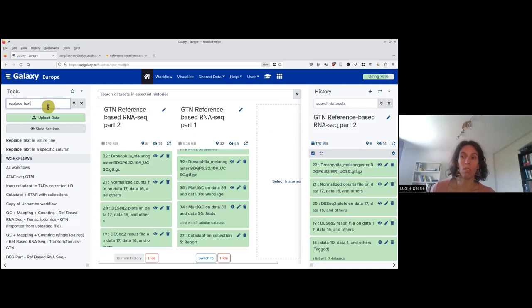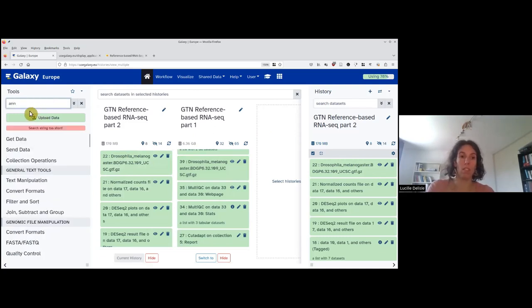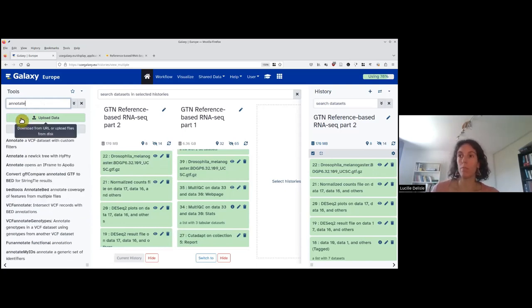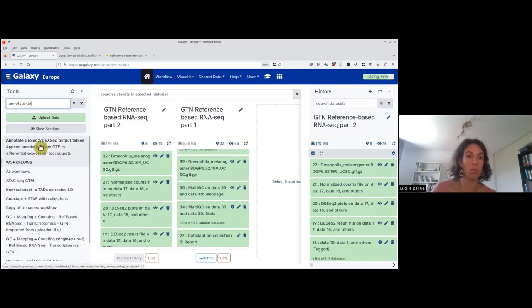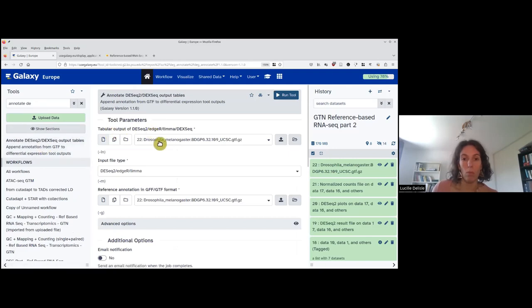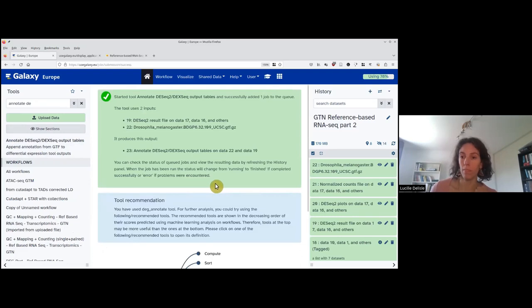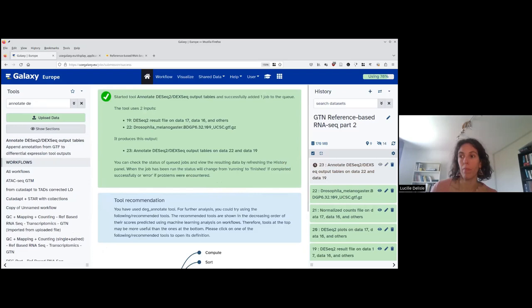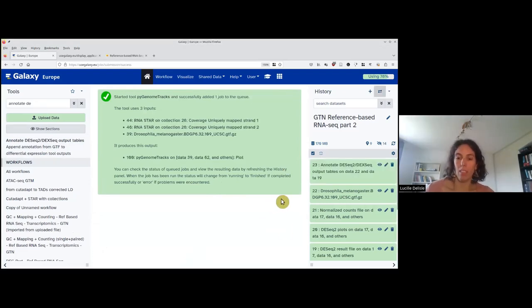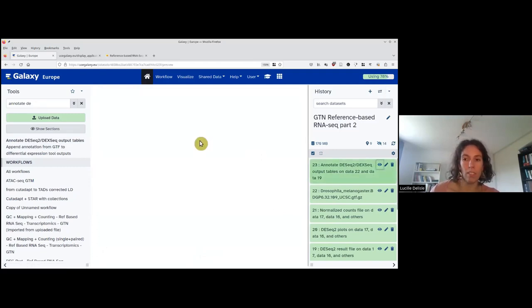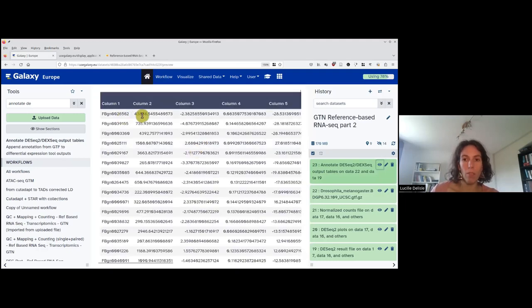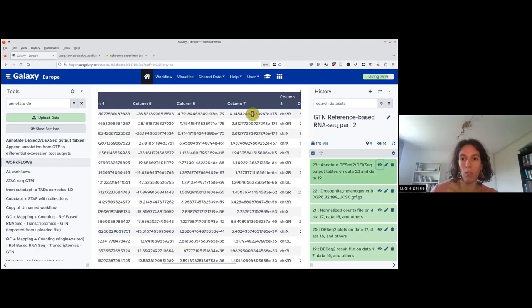Now we can use the tool 'annotate DESeq2 output table.' The tabular output is the DESeq2 result file, and we give the GTF. We run the tool. Checking the result with the eye icon: we still have gene ID, average normalized expression, log two-fold change, error on the log two-fold change, the statistic, p-value, adjusted p-value. And now we also have the coordinates of the gene: chromosome, start, end, strand, type, and then the gene name.